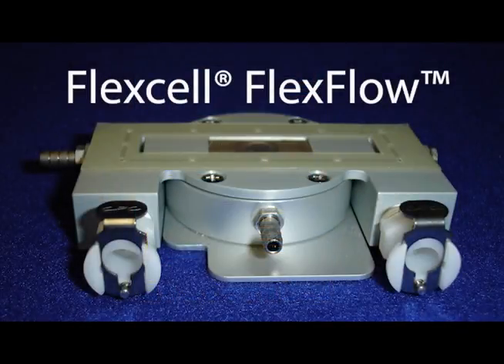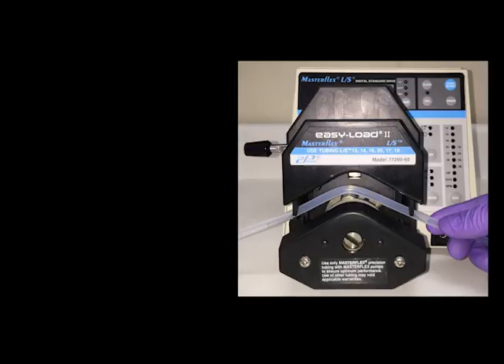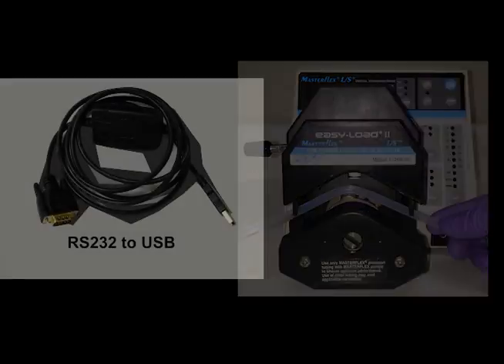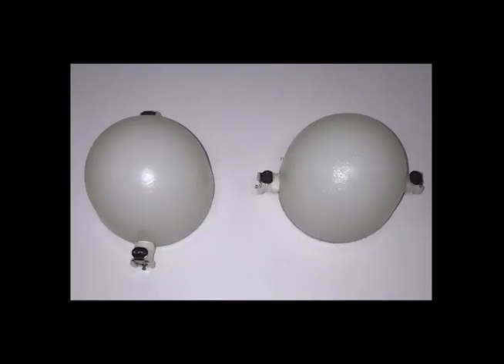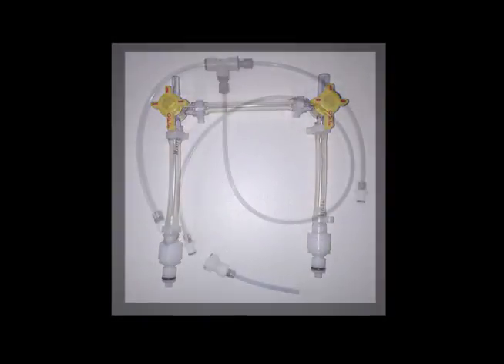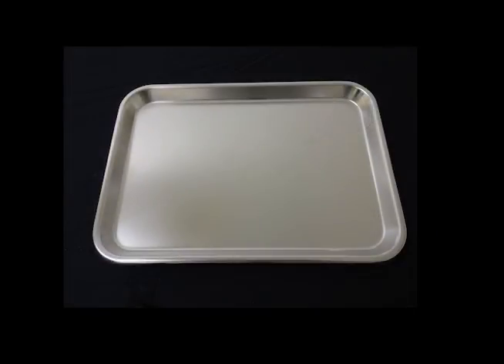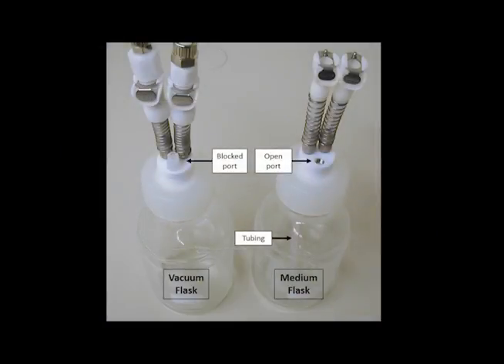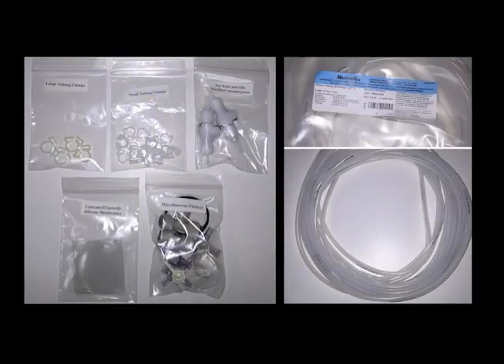To assemble your FlexCell FlexFlow Sheer Stress Device for stretch or flow applications, you will need your FlexFlow device, which consists of the stage flexor body and FlexFlow top with quick disconnects, your MasterFlex peristaltic pump with pump head and power cable, the RS232 serial to USB connector cable, silicone lubricant, two pulse dampeners, the FlexFlow bypass connector, the FX5000 tension system adapter, the white PVC volume additive, a fluid collection tray, one 500 mL culture media collection reservoir with quick disconnects, one vacuum bottle with quick disconnects, and the supplied tubing, fittings, adapters, culture slips, and stage flexor membranes.